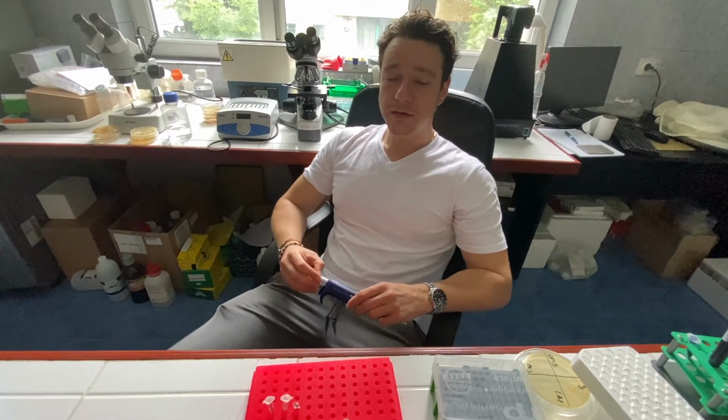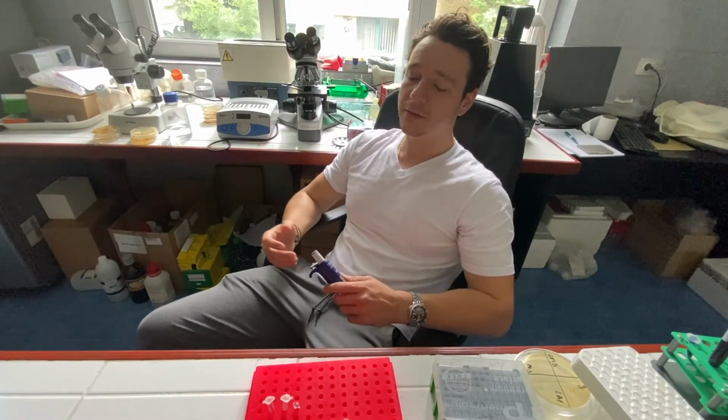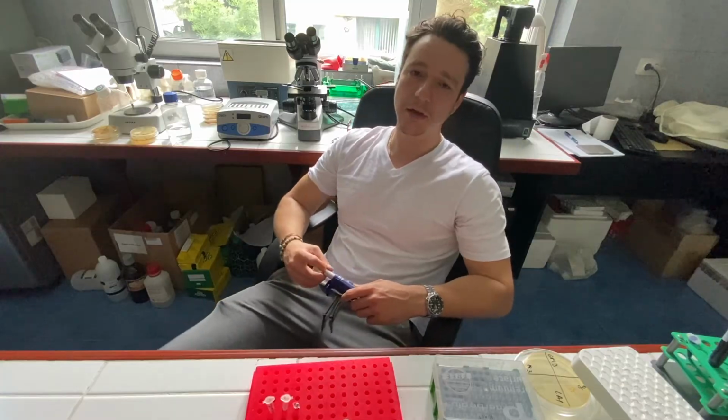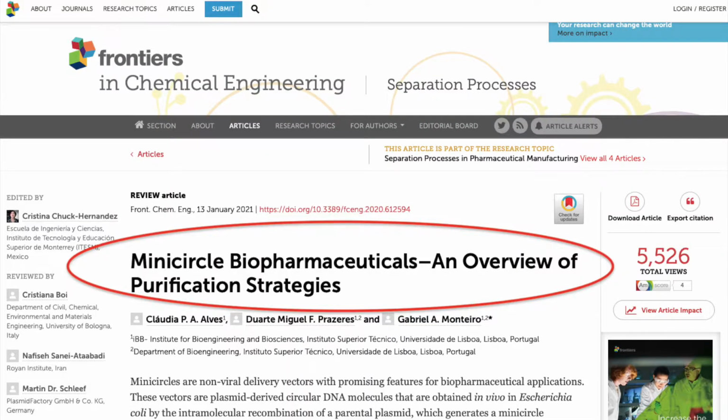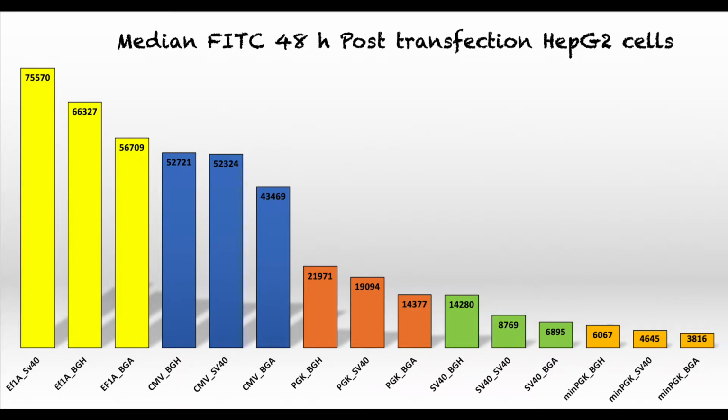These results I'm not going to try to publish because I cannot do this experiment in duplicate or triplicate anymore. However, results are results, and these will definitely help me in the long run and for the projects that will follow with this gene therapy. So without further ado, and if you want more details, let me explain to you exactly what I've been doing and show you what results I got until now.